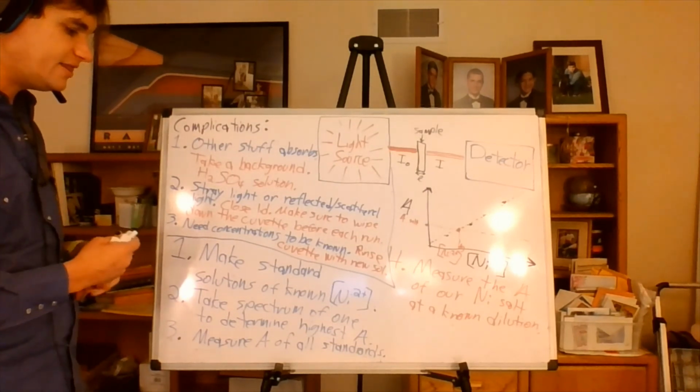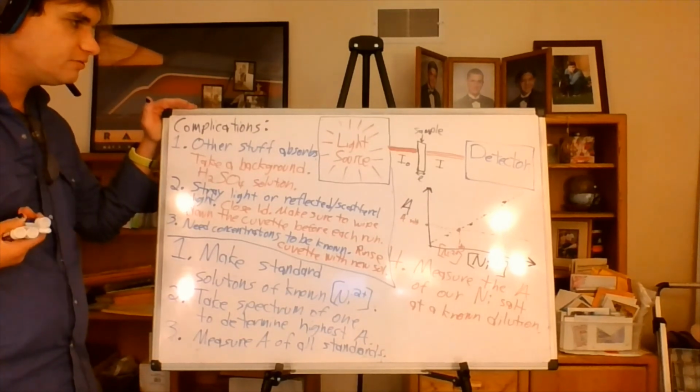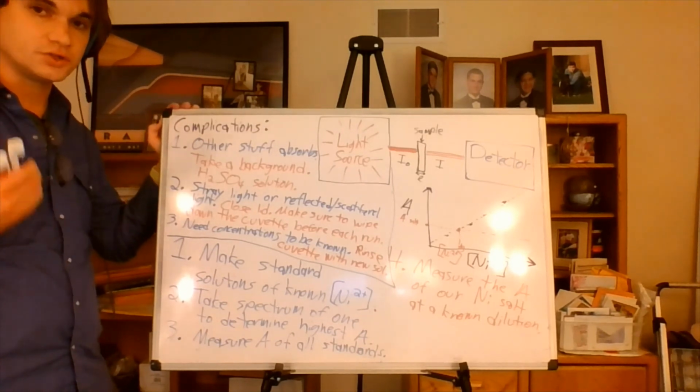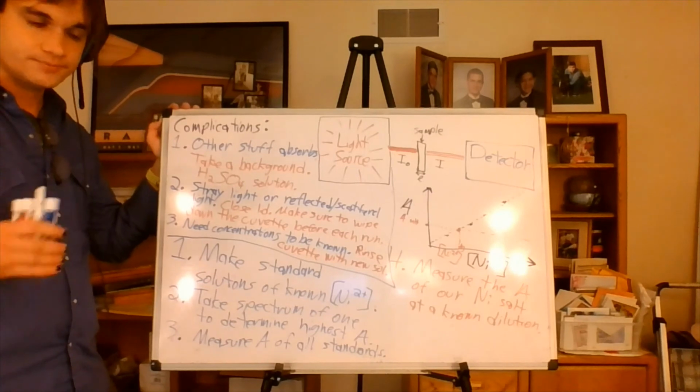So that is what we're going to do in order to measure the concentration of nickel in our salts.